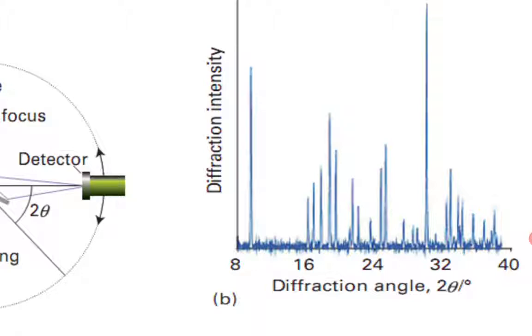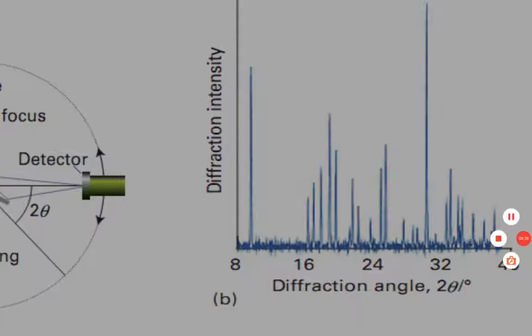Nearly all crystalline solids have a unique powder X-ray diffraction pattern in terms of the angles of reflection and their intensities. In a mixture of compounds, each crystalline phase present contributes to the powder diffraction pattern its own unique set of reflection angles and intensities. Typically, the method is sensitive enough to detect a level of 5 to 10% by mass of a particular crystalline component in a mixture.